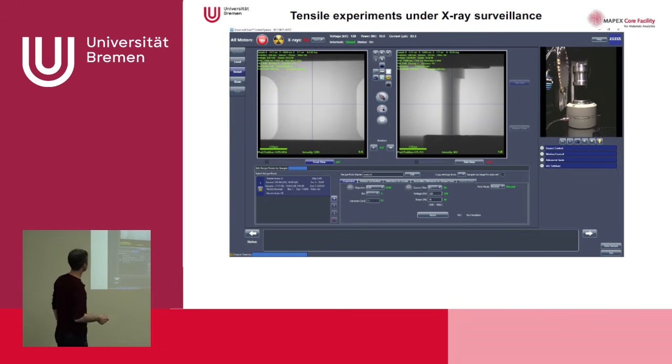That's, for example, something I did with some customers from the European Space Agency. So they had some metal parts that were interesting for space vehicles, some interesting alloys, and we wanted to see if you stress them by tension, how do they break? They had different alloys and they broke differently. I will just show you what we can do in this cell.